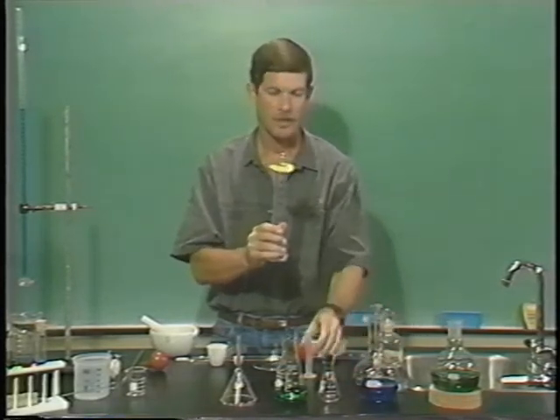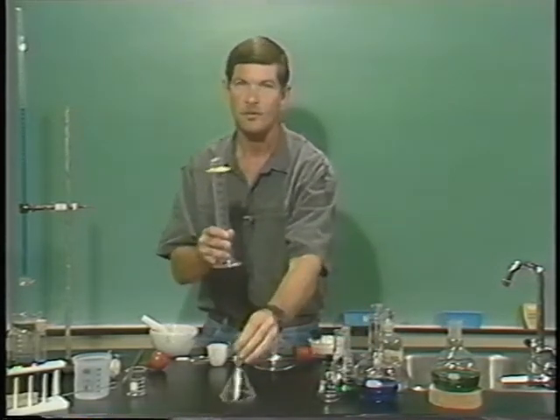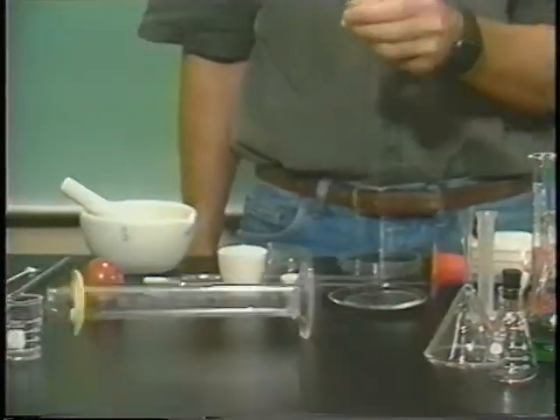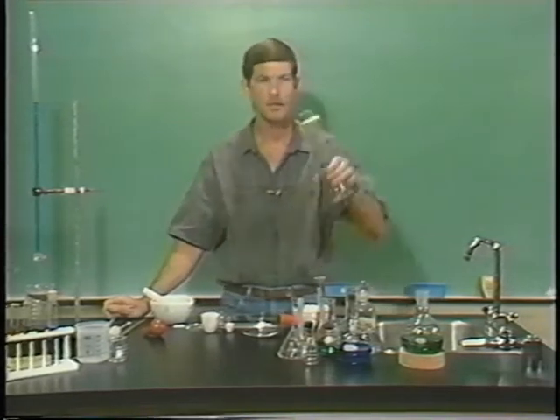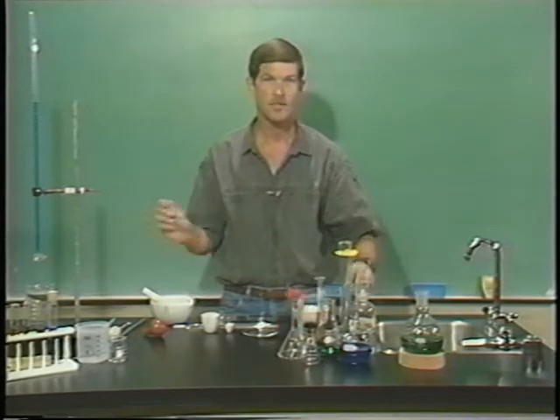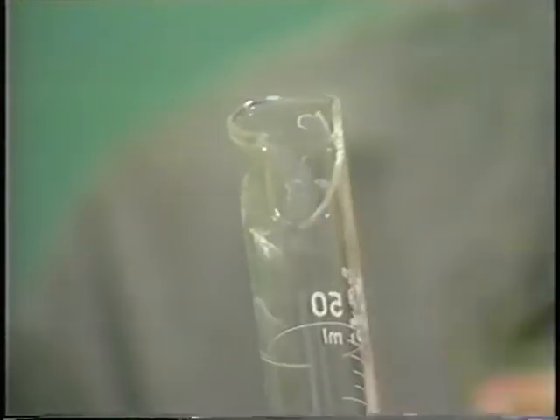And the purpose of it is that if the graduated cylinder happens to get knocked over, then this little ring will save it. Watch what happens when we knock it over. The only time the cylinder guard won't help you is if it falls off the edge of a table or into a sink, then it might break at the base or somewhere. One of my students wasn't cautious enough, had the ring down here, and look at what happened to the top of this one. Graduated cylinders are precision instruments and cost quite a bit, so be careful when you're using them.